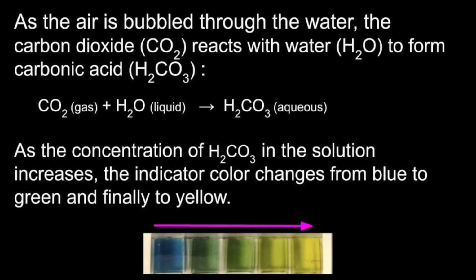As the air is bubbled through the water, the carbon dioxide reacts with water to form carbonic acid. As the concentration of carbonic acid in the solution increases, the indicator color changes from blue to green and finally to yellow.